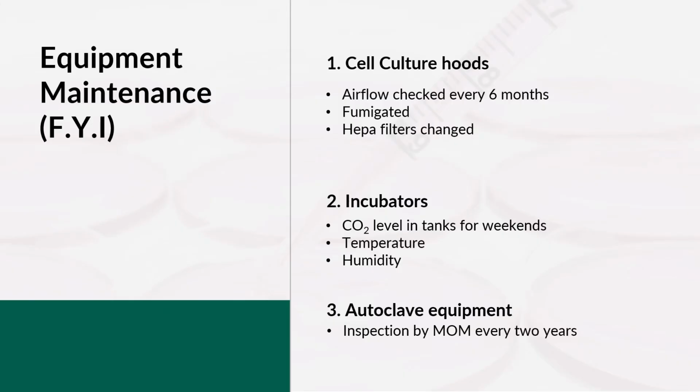Okay, and next is the water drainage. Okay, how this autoclave can drain out the used water. So you have to inspect and clean the autoclave's drainage to prevent any clogs and also to ensure there is proper water drainage during and after the sterilization cycles.